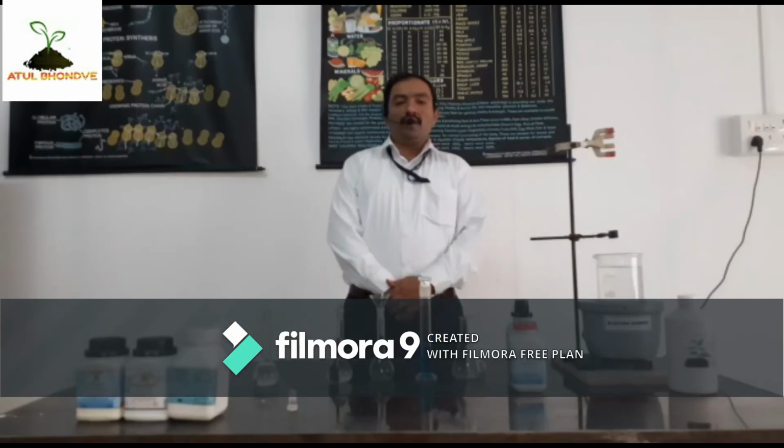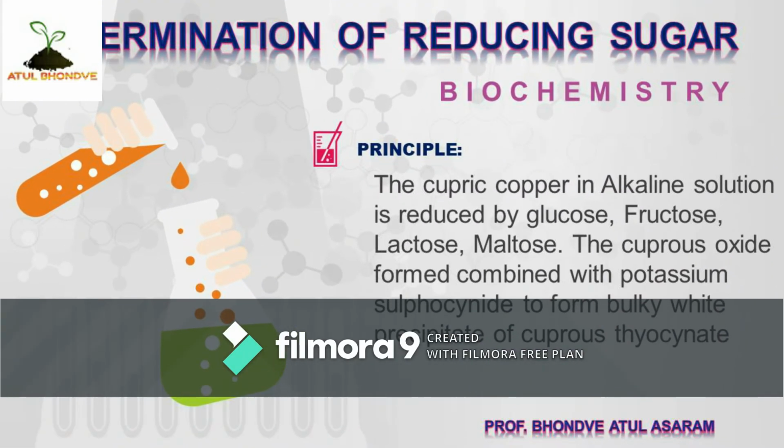Before the start of our actual practical, the principle of determination of reducing sugar. The cupric copper of Benedict's reagent is reduced by glucose, fructose, lactose and maltose, and the cuprous oxide so formed reacts with potassium thiocyanate to form cuprous thiocyanate, which is indicated by the formation of a white precipitate.